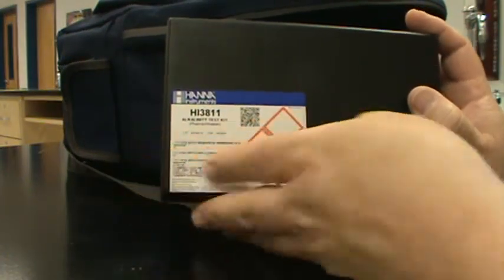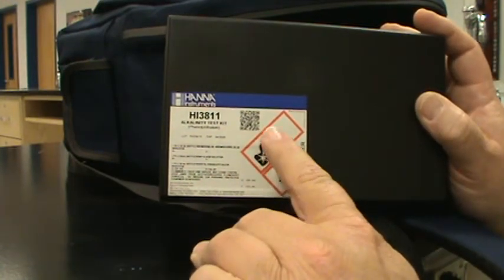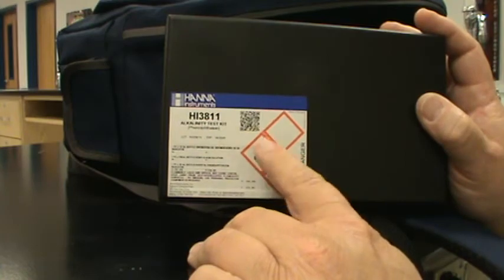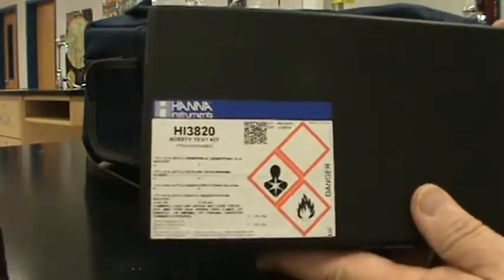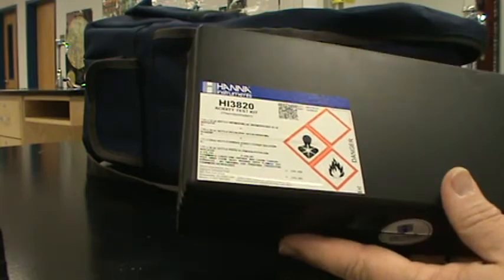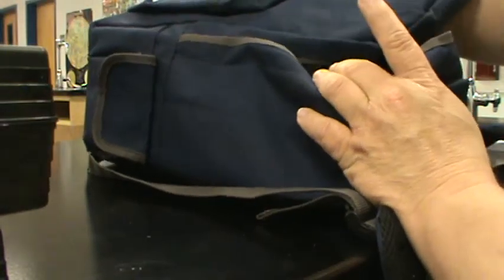Now, alkalinity has to do with how much acid the water can absorb before it starts to change and becomes toxic to plant and animal life. We also have an acidity test kit, basically the opposite of the alkalinity, more of a pH scale testing for our water if we need to do it.